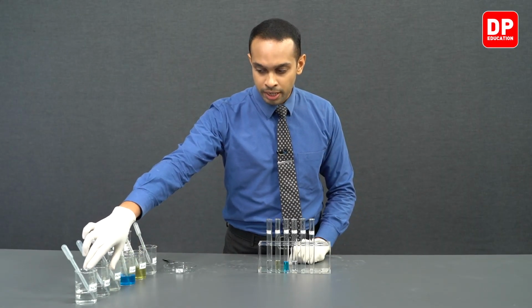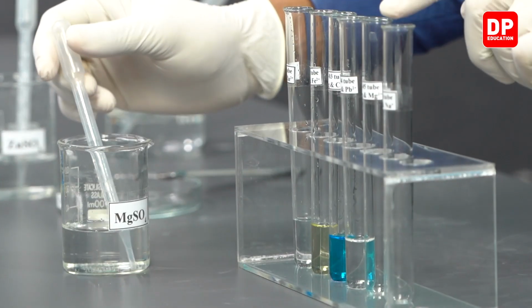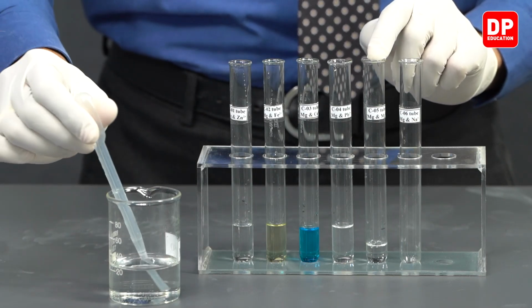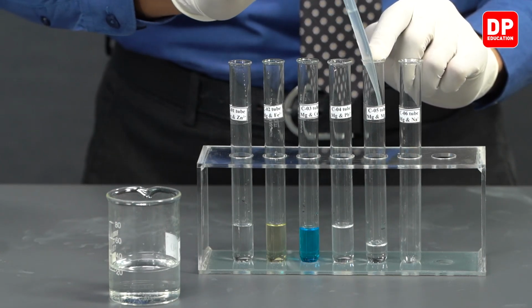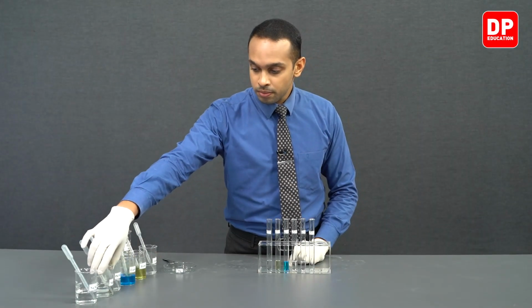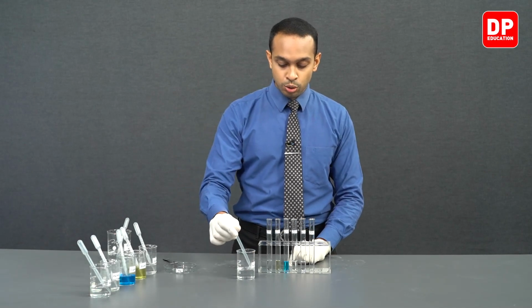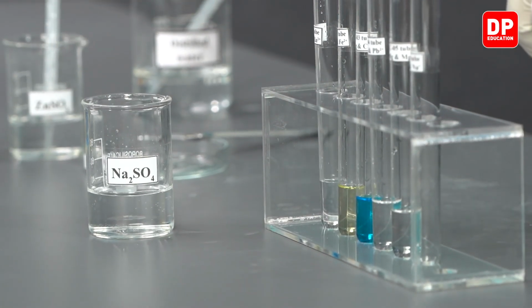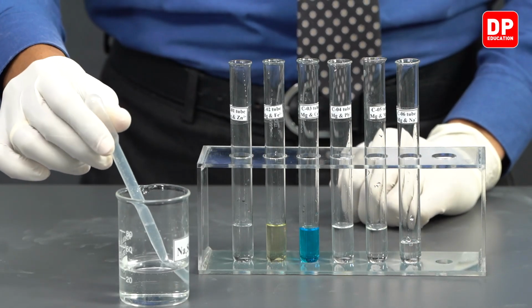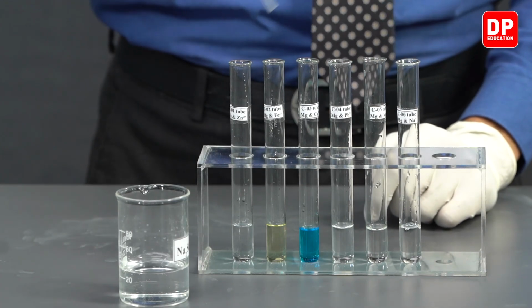C5 test tube has magnesium 2 plus ions written in the label, so we will transfer magnesium sulfate into our C5 test tube. And finally, to our sodium 1 plus labeled test tube, or C6 test tube, we are going to add sodium sulfate.